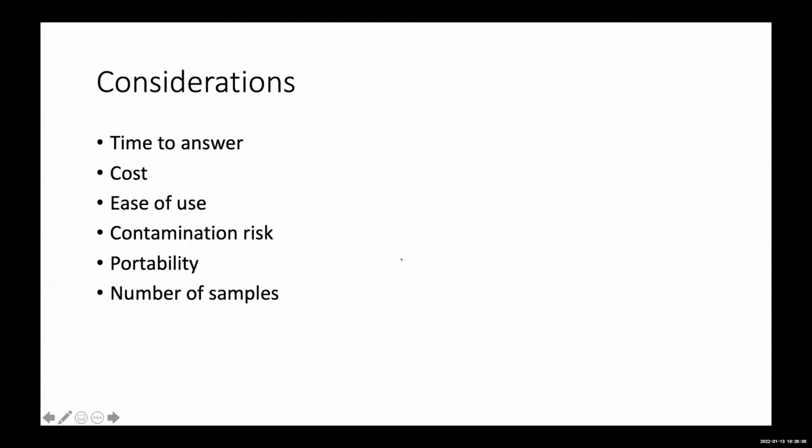So obviously, sequencing SARS-CoV-2, it's an RNA virus. This is similar to a lot of other projects that ARTIC have worked on in the past, ARTIC Zika. We've basically been maintaining, improving and updating this protocol over time.